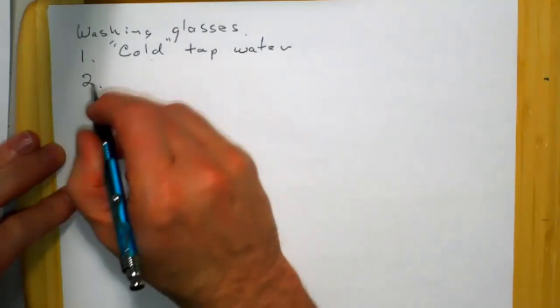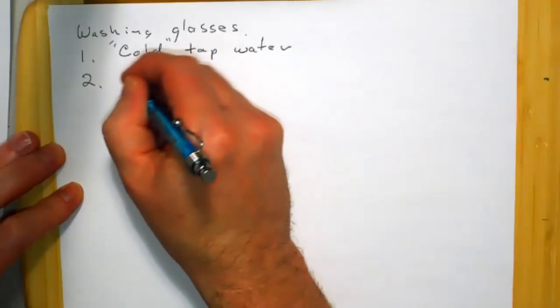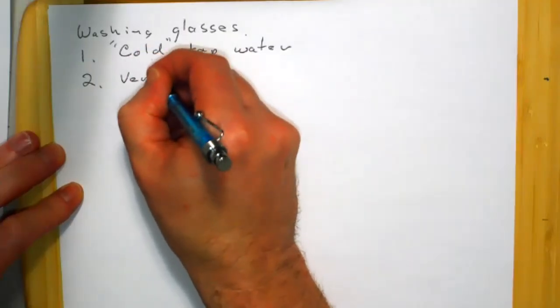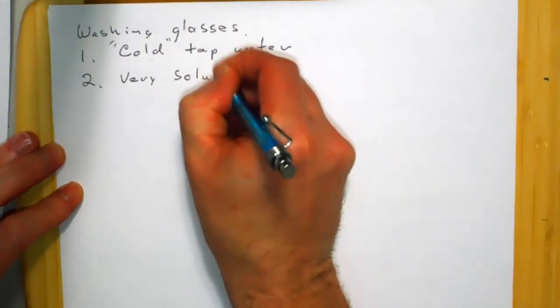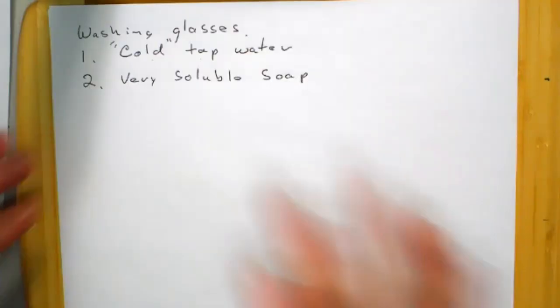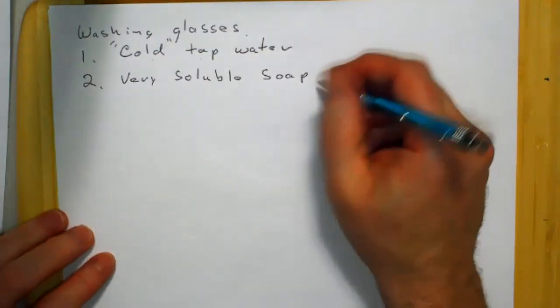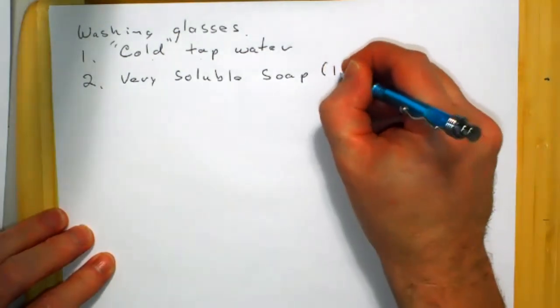All right. Cold tap water and very soluble soap. There's usually at least two soaps in the lab, and one is powder, and we're going to use the liquid.